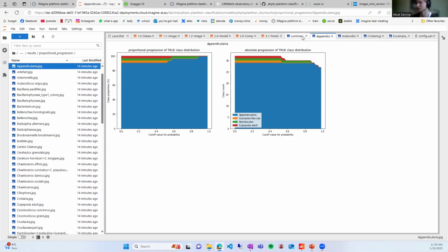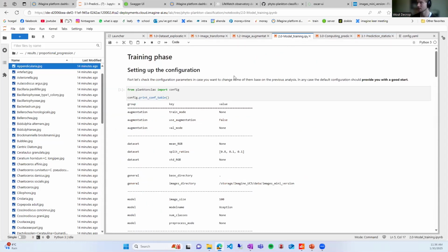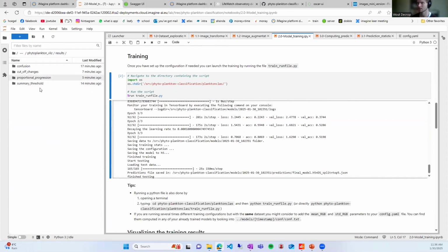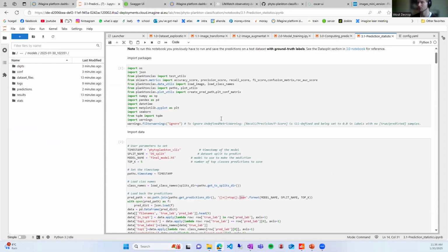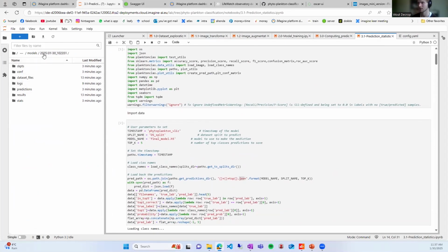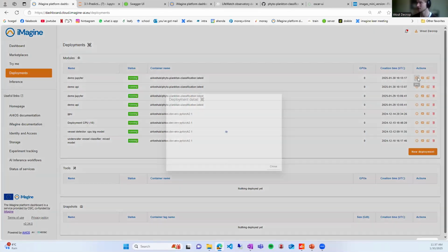So I'll close all of these. And then the model is still training, I assume. So here, it's done. Now we have created a new model file, and we can do the same thing for the predictions for this new short model, but we have to say the location of this model. You have to say this timestamp instead of the phytoplankton VLIZ, and the same thing can be done. And we can also look at the performance.